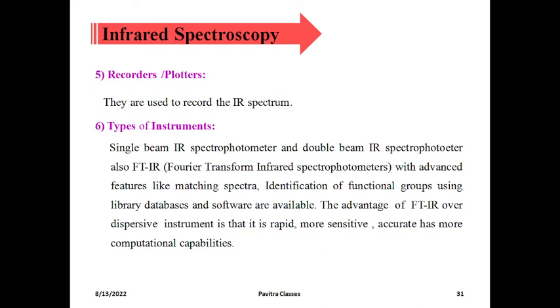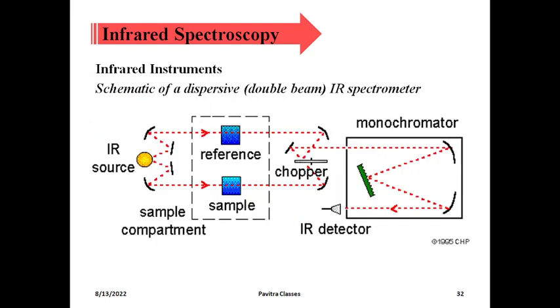You can compare the graph. So the time will be very less and you can do more work in that time with the FTIR machine. So this is the schematic representation of the dispersive IR meter, not Fourier. This is the dispersive meter.